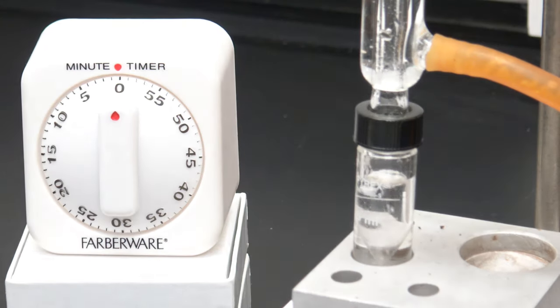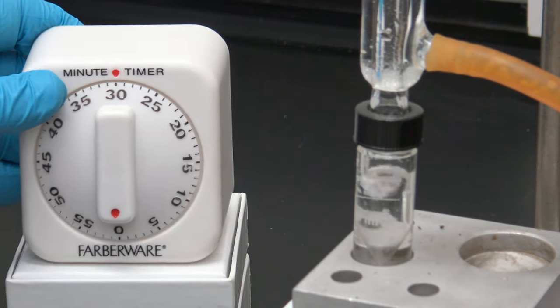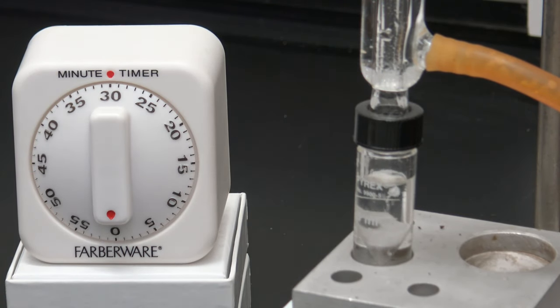I now consider that a vigorous boil. We're now going to continue to boil it or reflux it for 30 minutes. So I'm going to set my timer for 30 minutes. And then we'll come back after 30 minutes and stop the reflux.